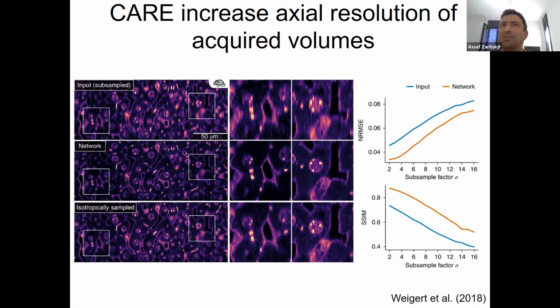What is a good image similarity measure? Okay, Alina, I'm afraid I didn't understand what image similarity is. What do you compare? I understand the x-axis, when you go down in resolution, but what do you measure? You always have your ground truth image as reference, because you start with a 2D image with high resolution. So this is your starting point, and now you compare the similarity to it. Okay, yeah. Okay, thanks.